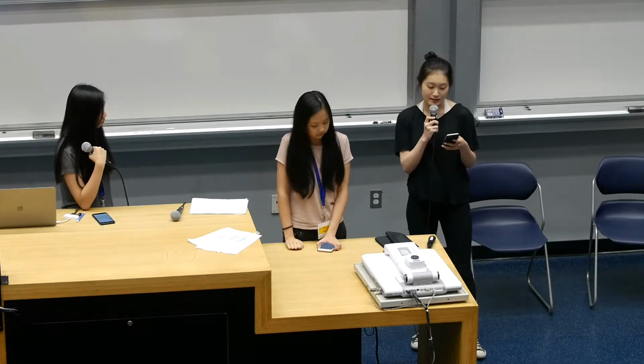Okay, so I'm gonna explain this lab procedure a little bit. In this lab, we put yeast cells in different Erlenmeyer flasks and we monitor the number of yeast cells by using a manometer. It's basically a tube and you fill it with a little bit of water. When the yeast cells do their respiration after they consume the sugar that we put in, they either produce some carbon dioxide or they respirate and consume oxygen. So the water level will rise or decrease. So that's how we measure.